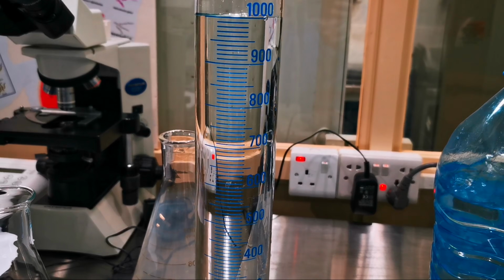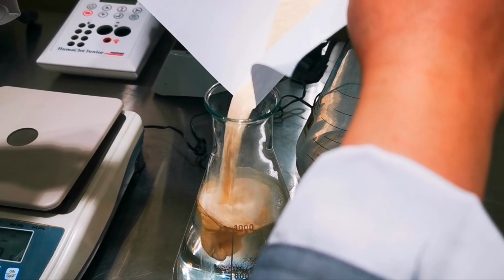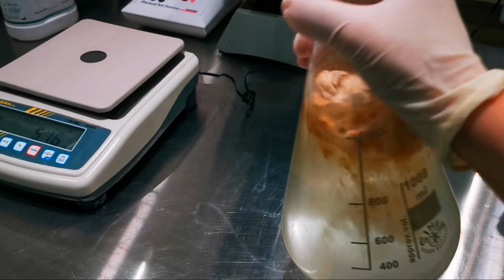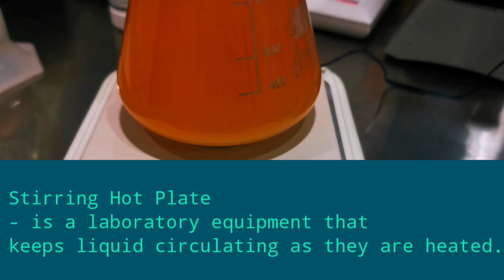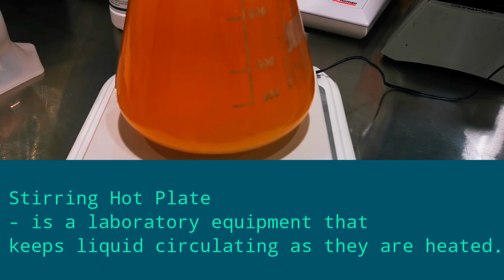Next is to pour 1 liter of distilled water into the Erlenmeyer flask and pour the agar. Then swirl it until all of the powder is dissolved. Next is to heat the solution with frequent agitation to completely dissolve the medium. For me, I use a stirring hot plate.